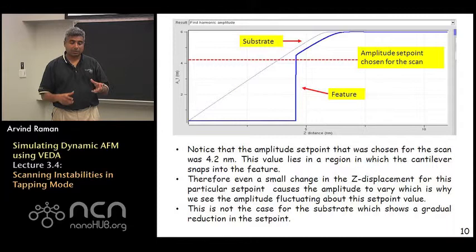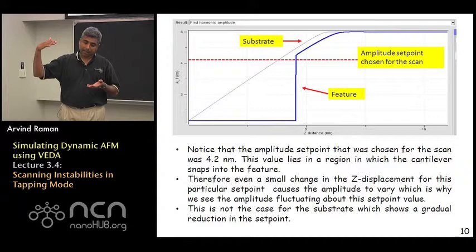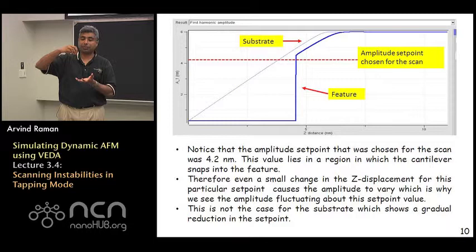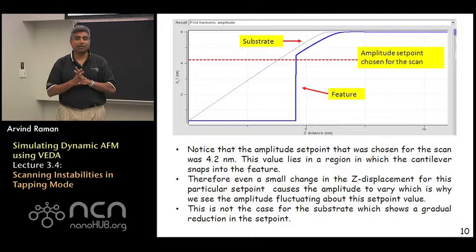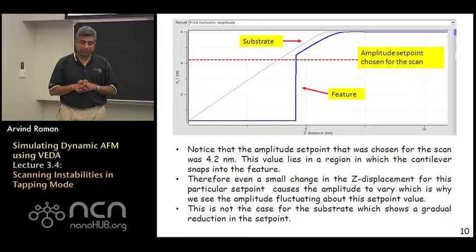Why this happens is basically related to an effect which we have studied in the context of static force distance curves that if the cantilever is brought very close to the sample and if the attractive forces are very large, remember the tip especially for soft cantilevers is going to snap into the sample. This can actually start happening even in dynamic AFM when you are dealing with very sticky samples and soft cantilevers.